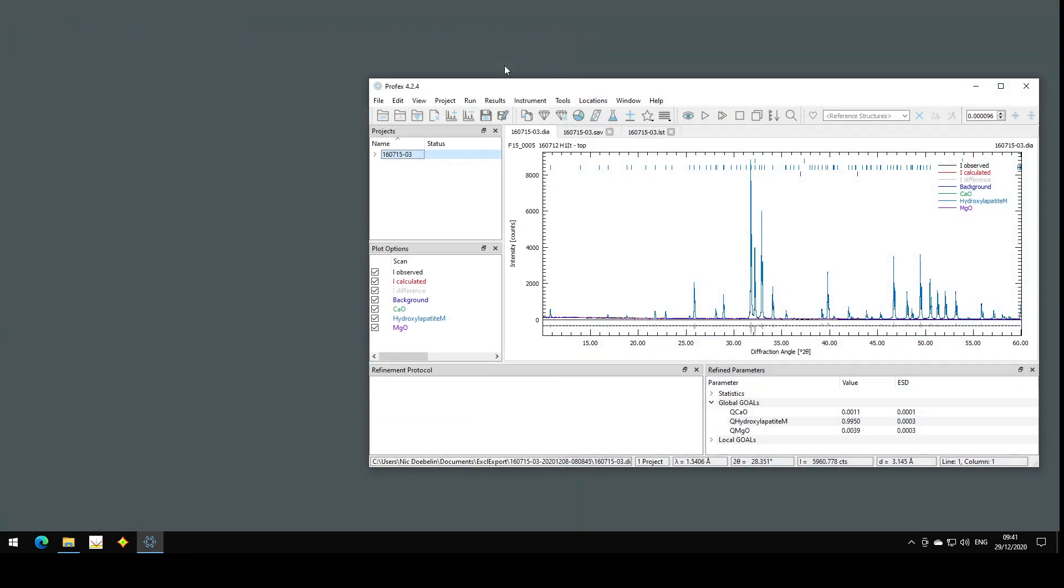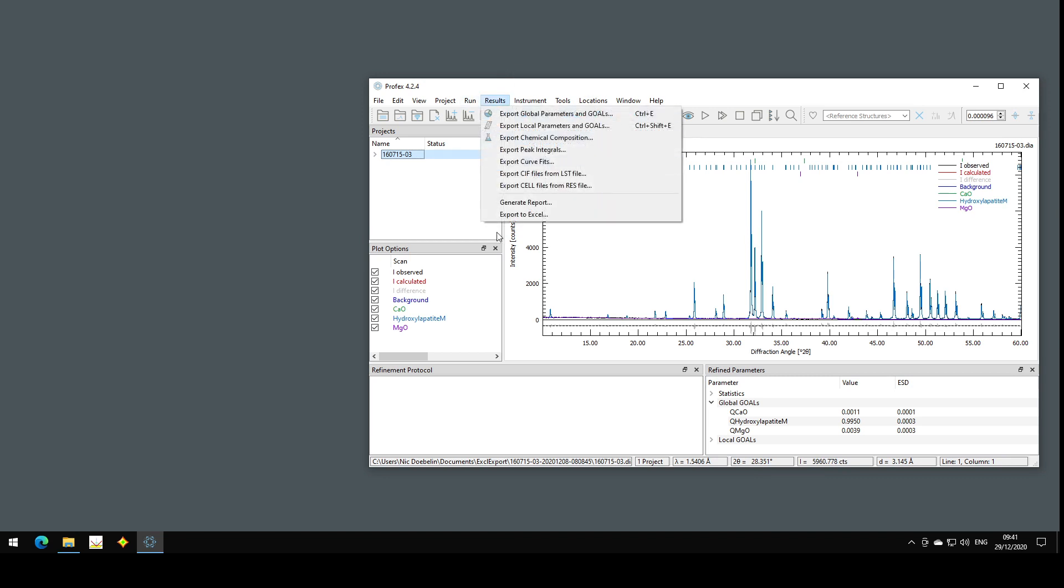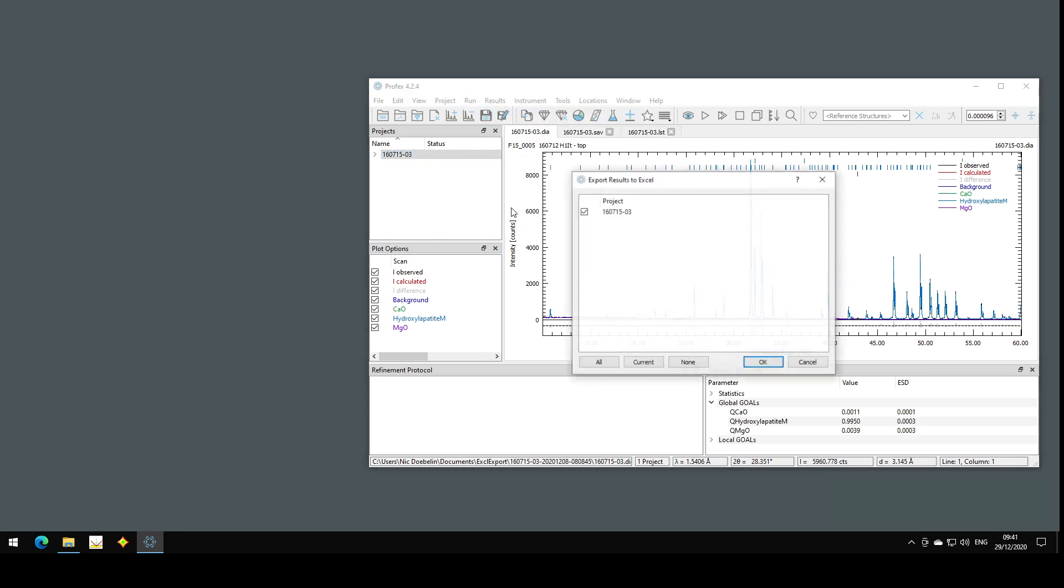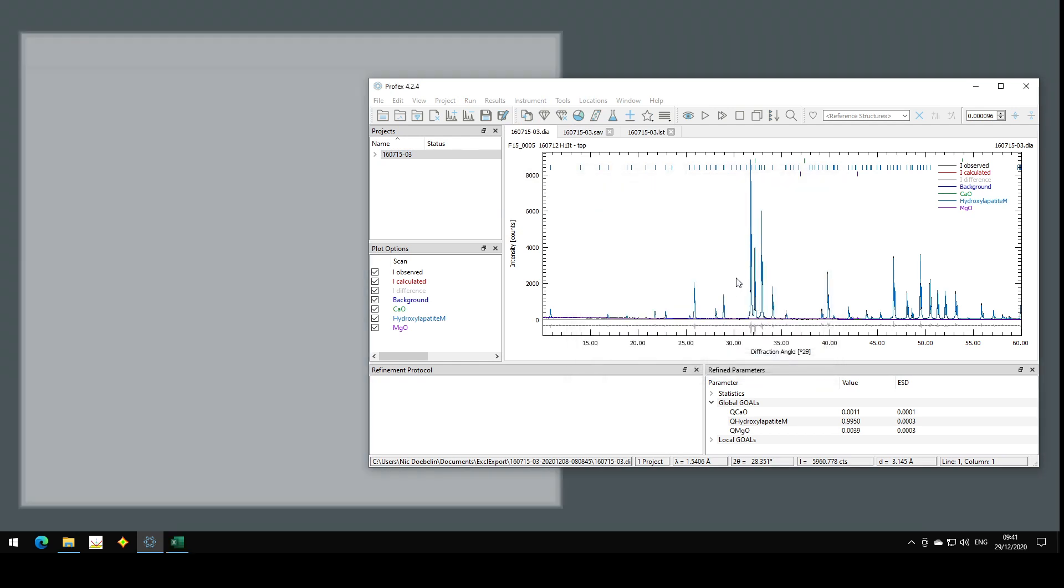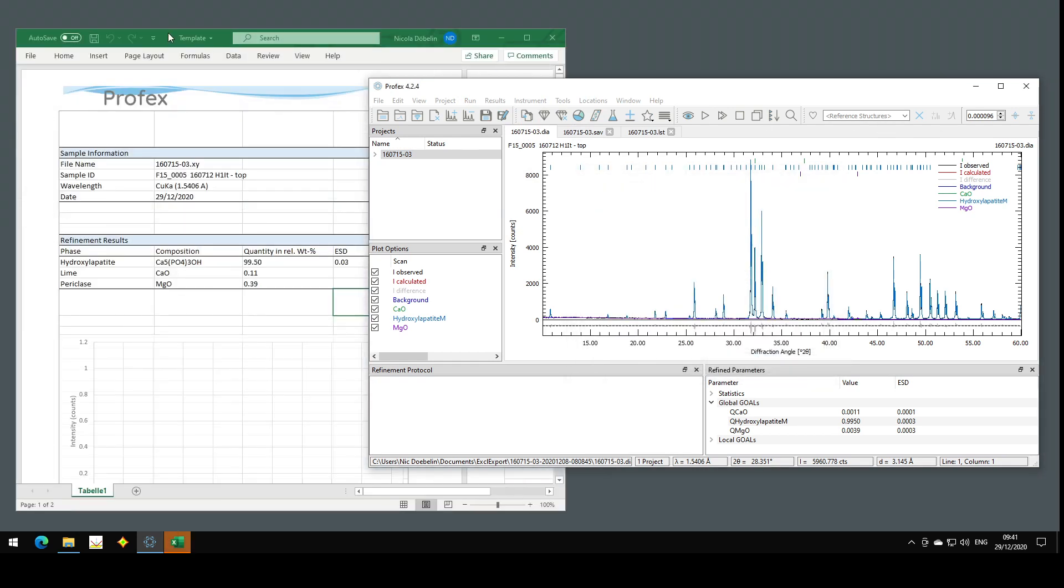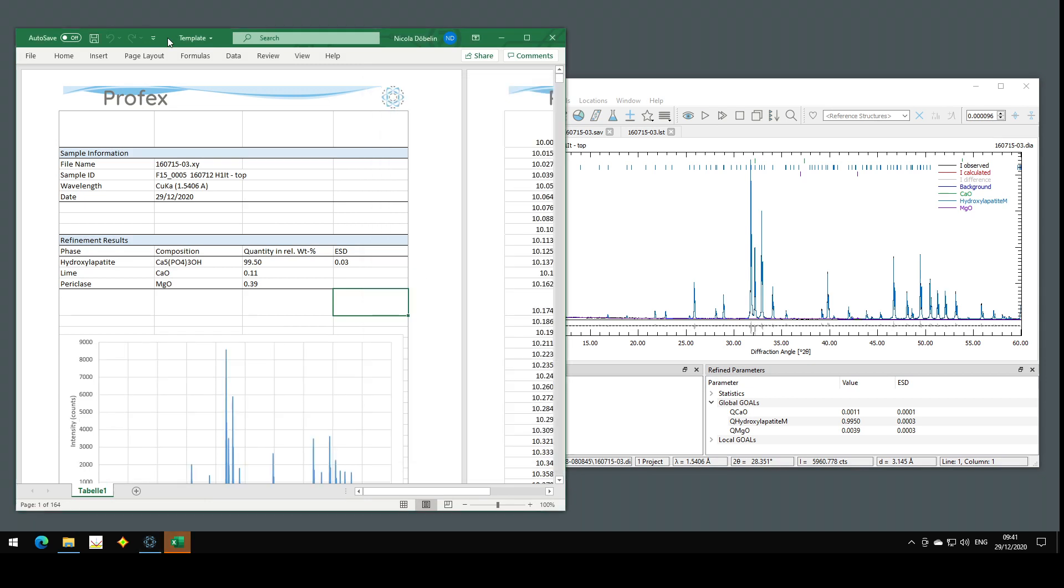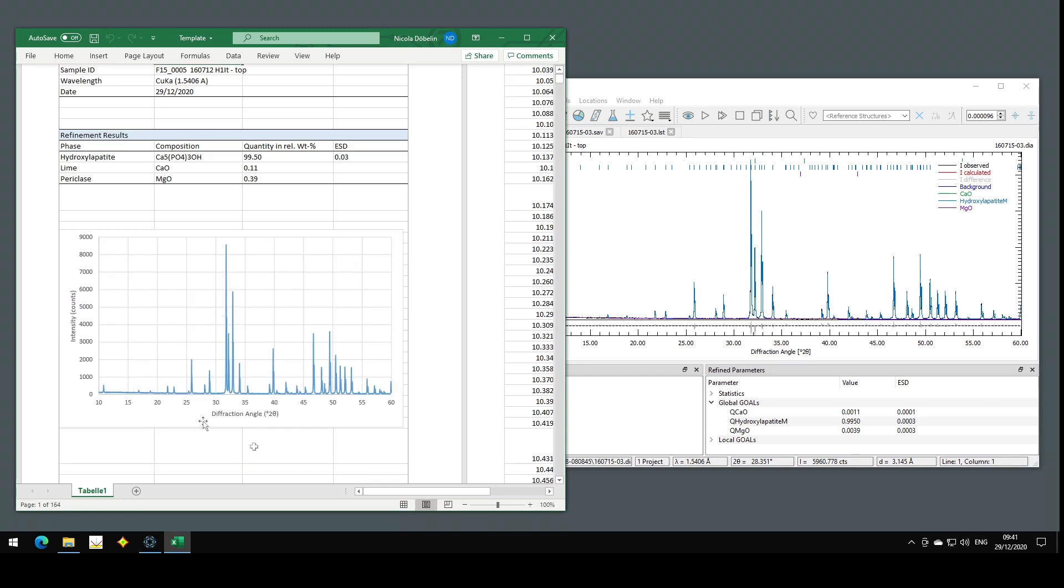Once I have set up the export in Profex, all I have to do is go to results, export to Excel, select my project, and when I click OK, Excel will open, and all the refinement results and the sample information will be inserted into the empty cells automatically, and also the diffraction pattern will be shown.